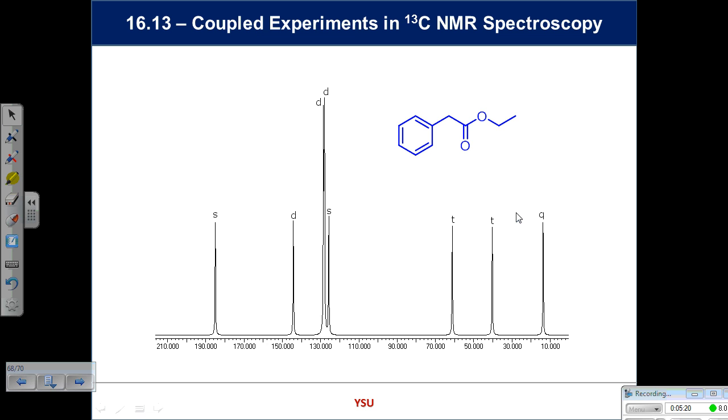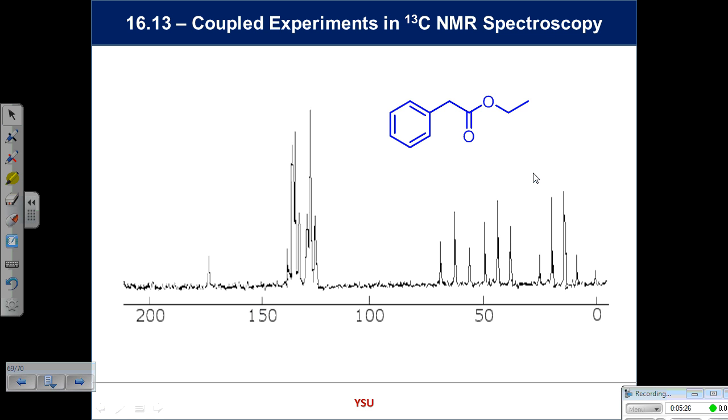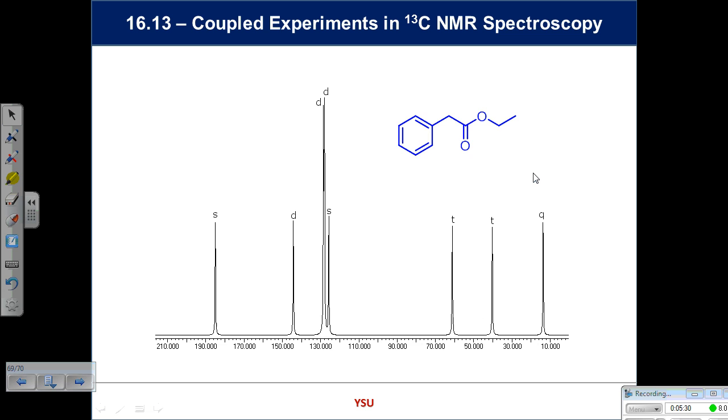Okay, got you. There is the typical decoupled spectrum where you've taken all that information out. Now, let's be careful here. That's more complicated, but that's more useful. There is more information there. If you're given this type of spectrum, you'd often be given the couplings underneath. I'm going to show you that with a couple of examples from old quiz questions in which you're given all that data in different formats.